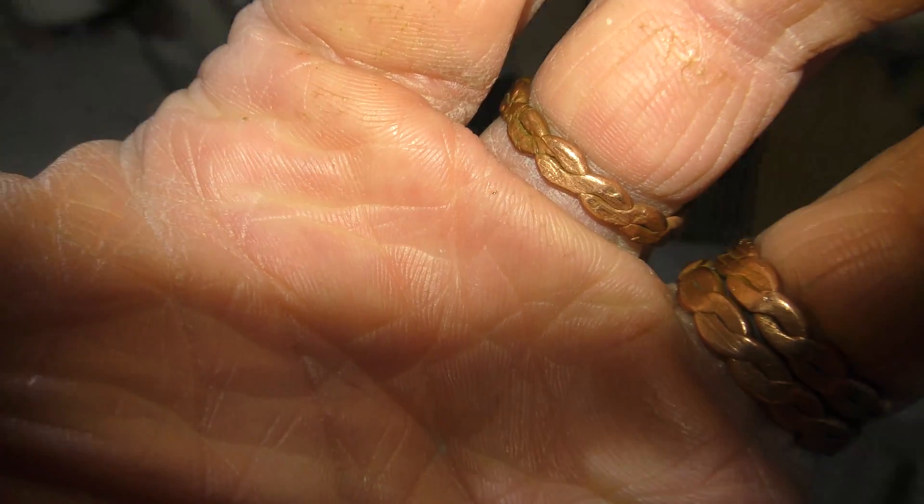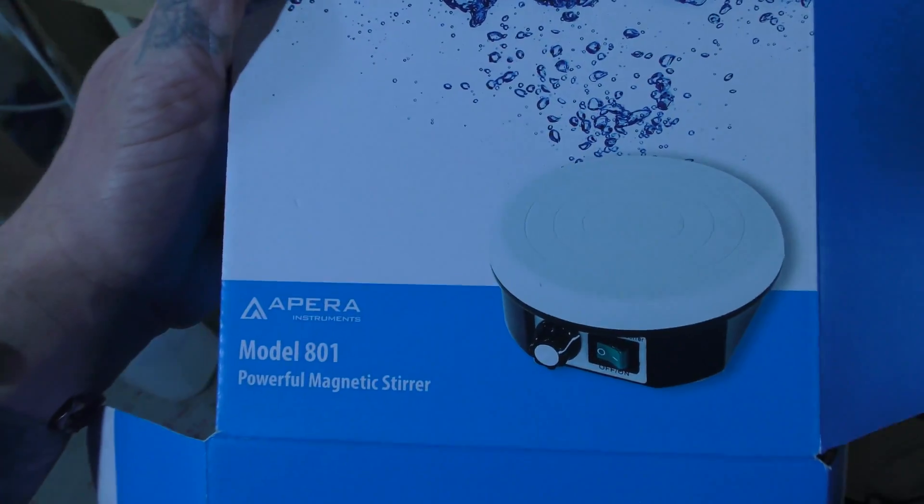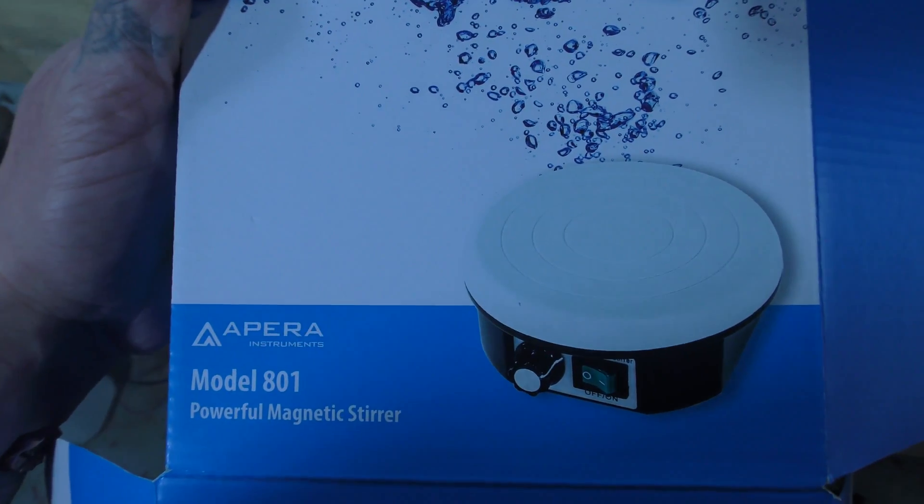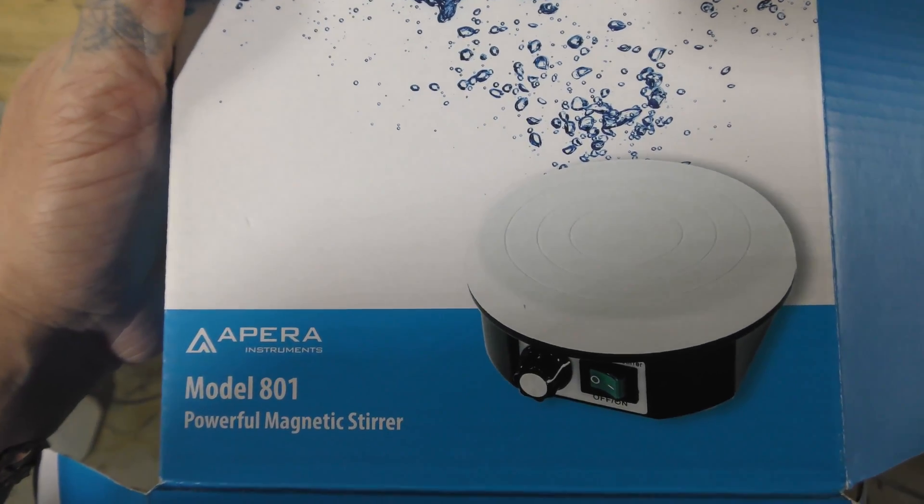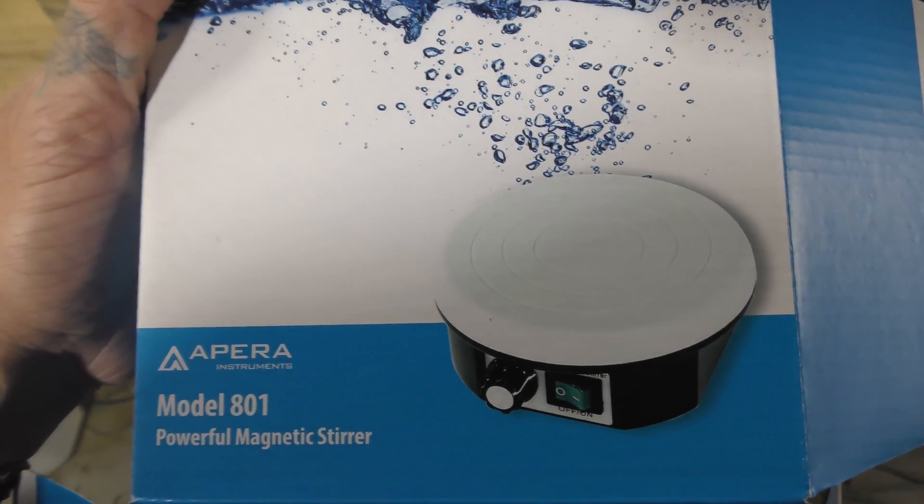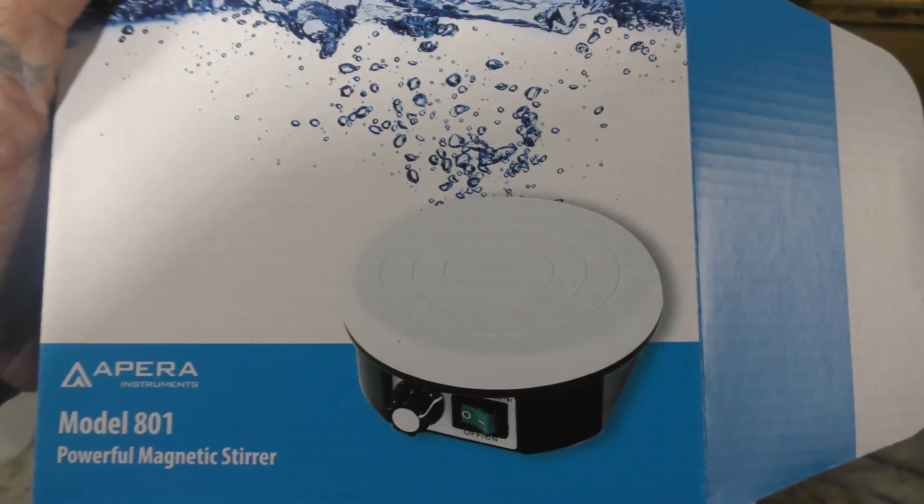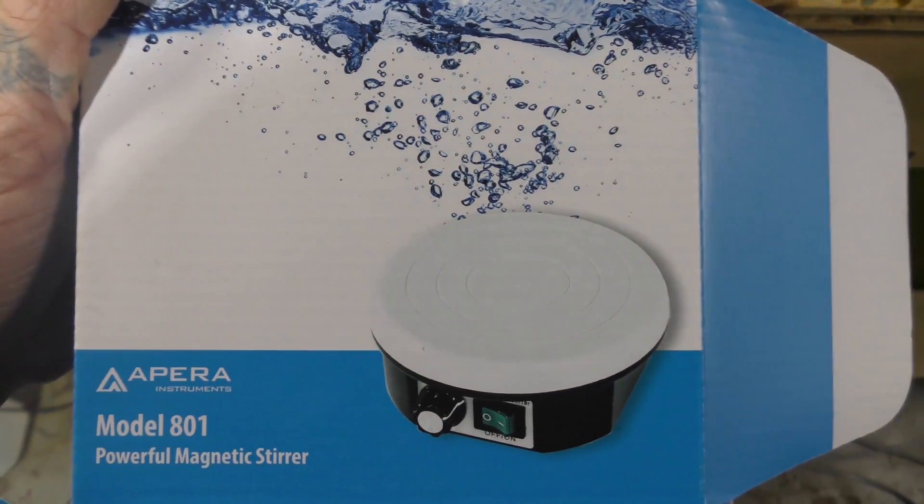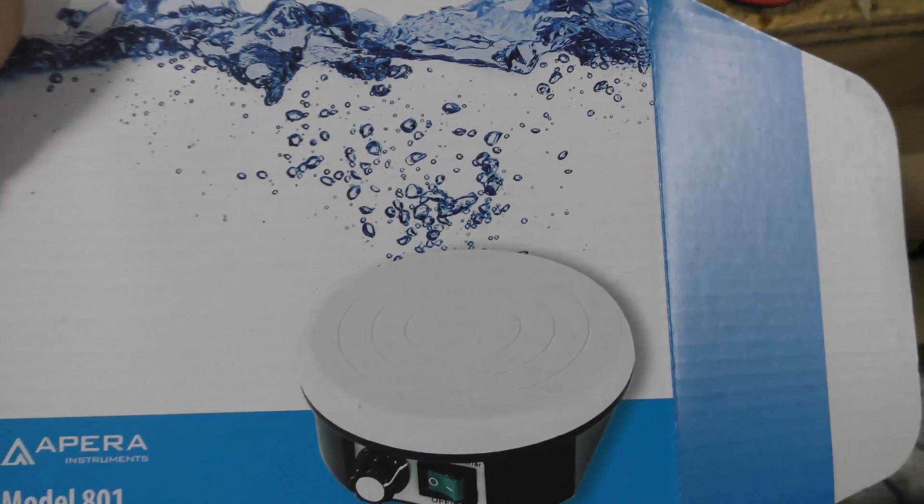So I'll show you what brand this is. This right here, that's an Apera Model 801. That is an amazing magnetic stirrer for how many gallons that's actually pulling around.